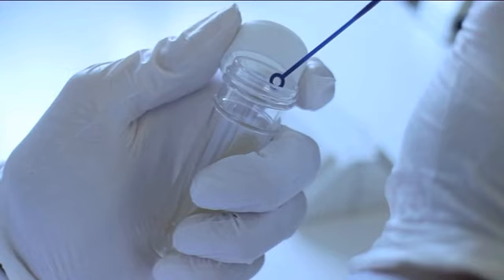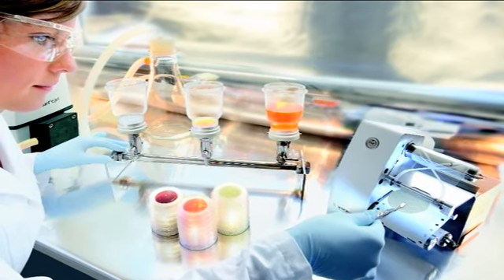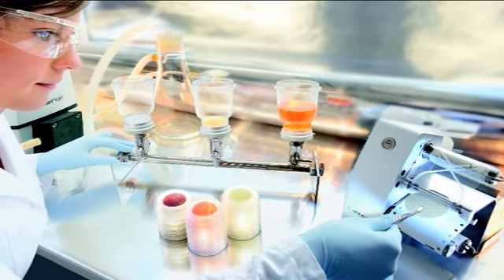In the laboratory, individual laminar airflow cabinets are commonly used for specialized work such as inoculation, culturing, media transfer, which involves working or handling microbes, etc., to eliminate airborne contamination that would otherwise interfere with work processes.